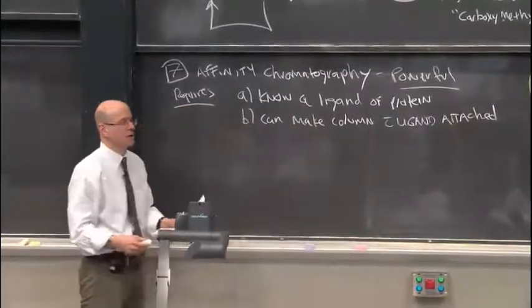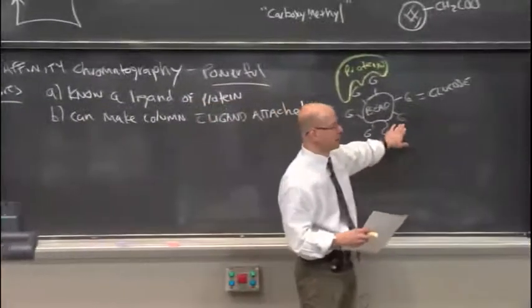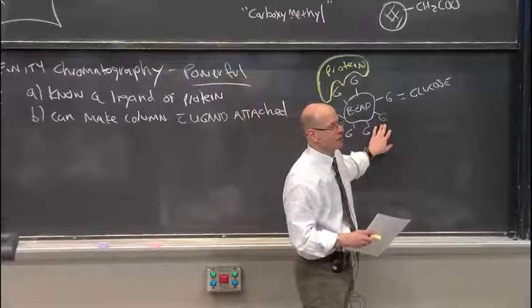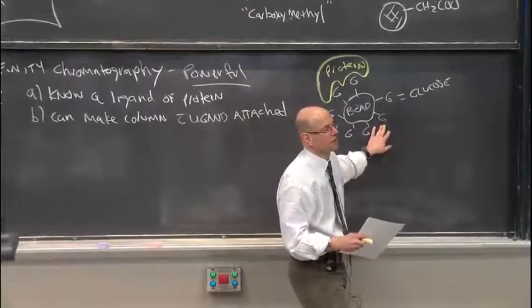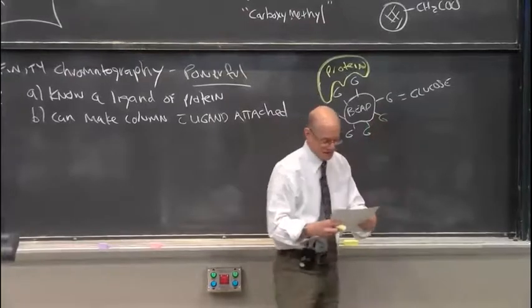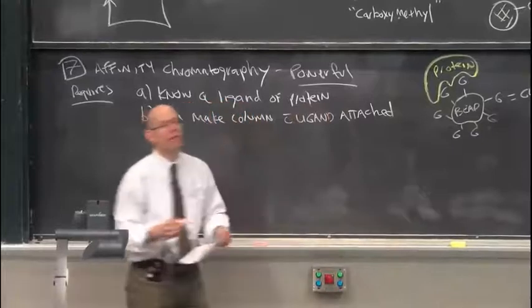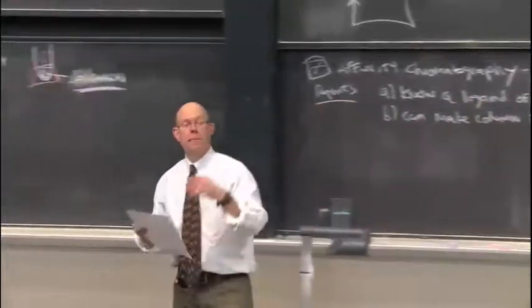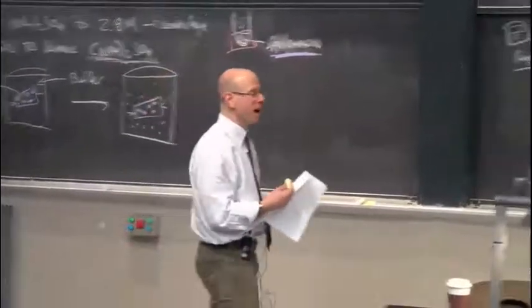Suppose I wanted to purify transcription factors. What might I want to put on the bead? Transcription factors are proteins that bind to specific DNA sequences. What should I put on the bead? DNA sequences. Now, suppose I want to purify a protein, but I don't know what it binds to. Could I engineer it to bind to something?